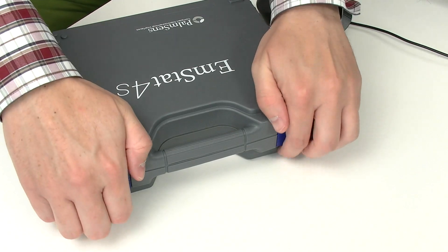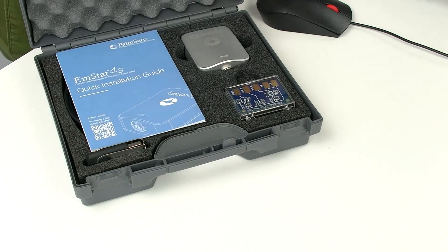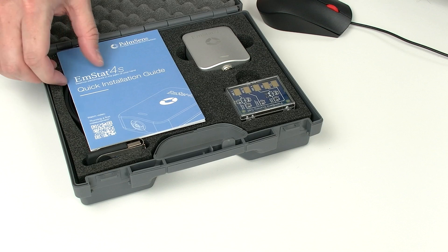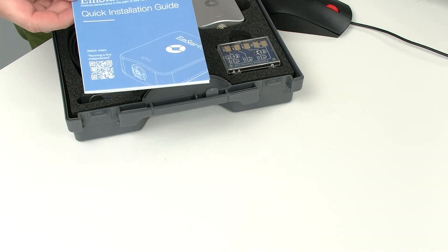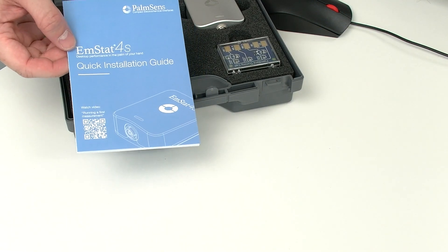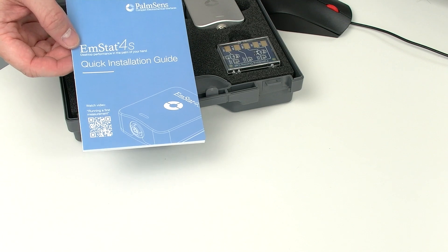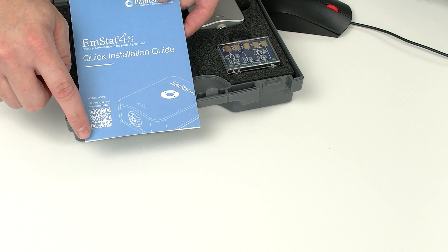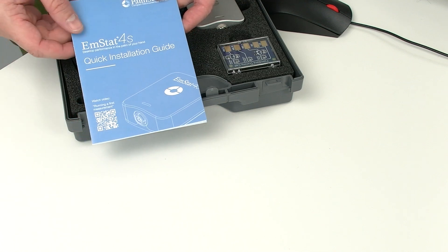Let's start by opening the box and have a look on the inside. You find everything very neatly arranged that you need to perform your measurement. For example, this quick installation guide that helps you to perform your first measurement just like this video. Maybe a few of you ended up here by scanning this QR code.